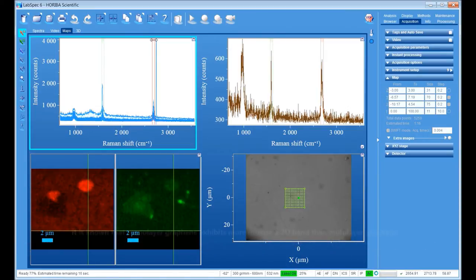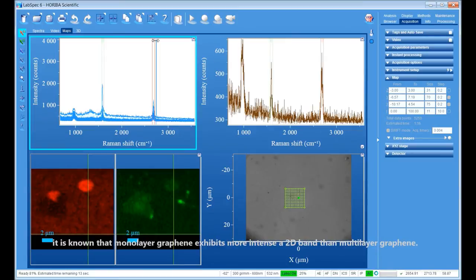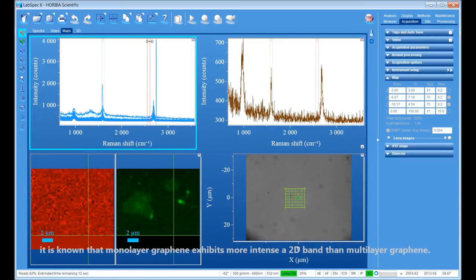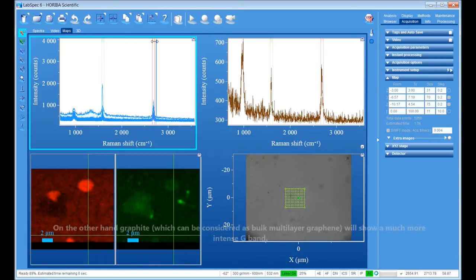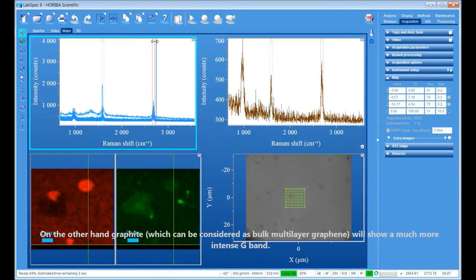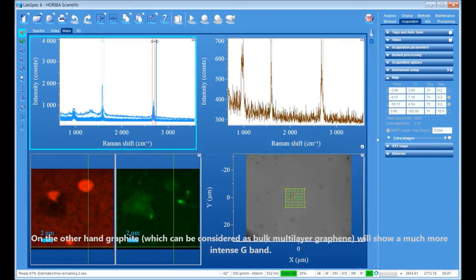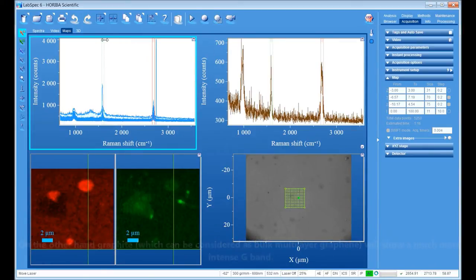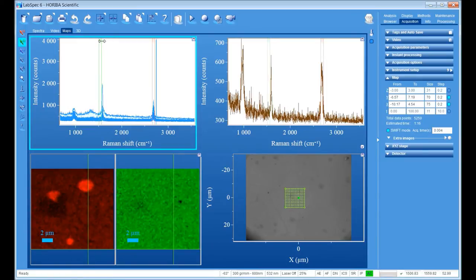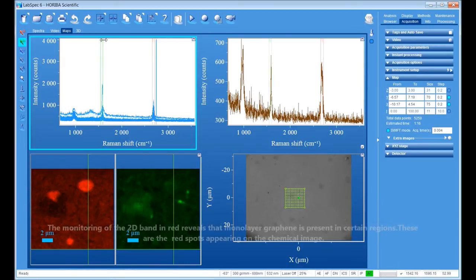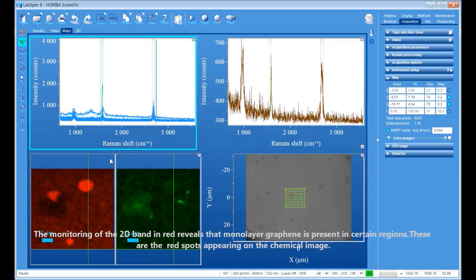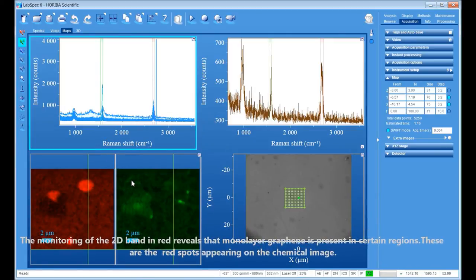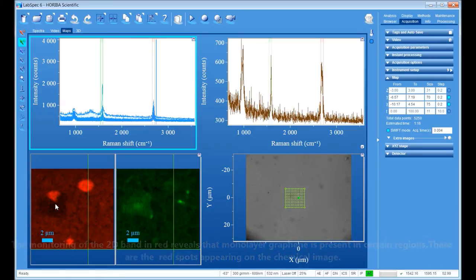It is known that monolayer graphene exhibits more intense 2D band than multilayer graphene. On the other hand, graphite, which can be considered as bulk multilayer graphene, will show a much more intense G band. The monitoring of the 2D band in red reveals that monolayer graphene is present in certain regions. These are the red spots appearing on the chemical image.